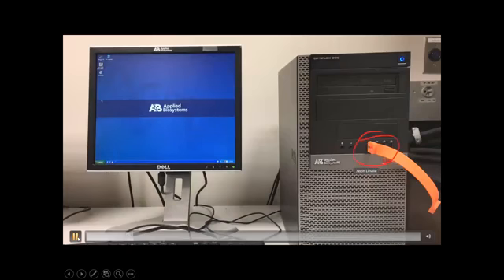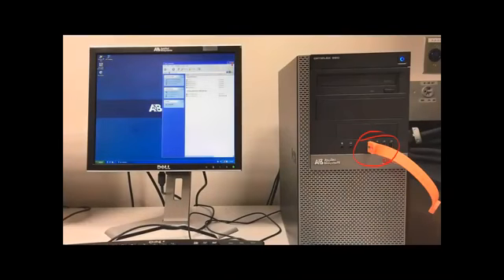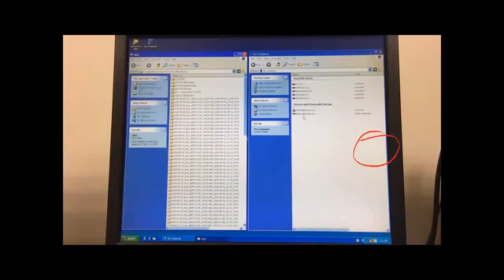Okay, so where this begins is you begin by putting the USB drive in there, and I apologize for the background noise. You want to open up those 2 icons. One is going to open up to where you can view what's on the USB drive. The other is going to open up the run folder, which is where you're going to have separate folders for every single injection. Since there's 4 capillaries, every single injection folder is going to have 4 files in it.